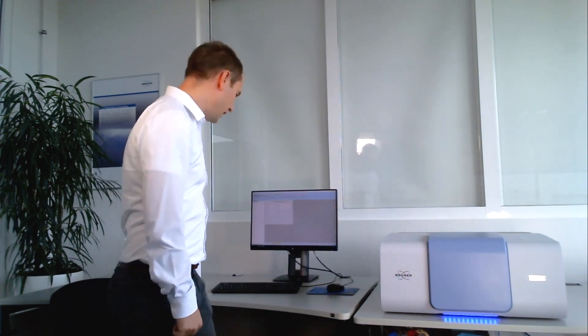Please note that we have skipped the background measurement in this live session just to keep the video as short as possible. Also, the real sample measurement is sped up a little bit. In real time the whole measurement will take approximately five minutes to cover the whole spectral range. We will now switch over to Opus and see how the measurement works.